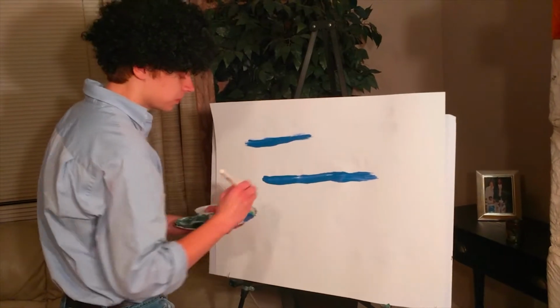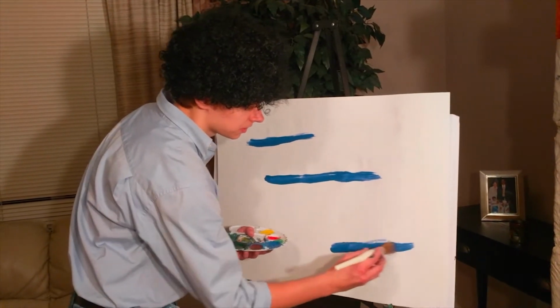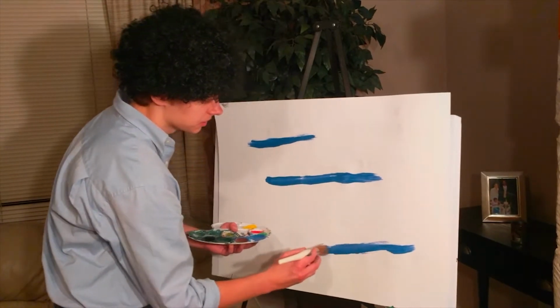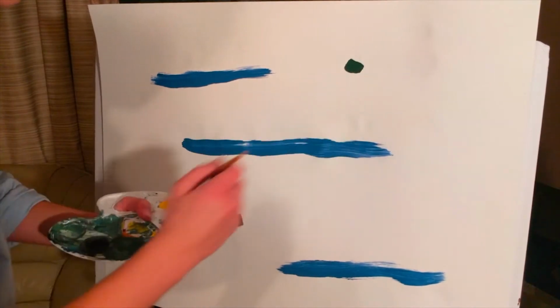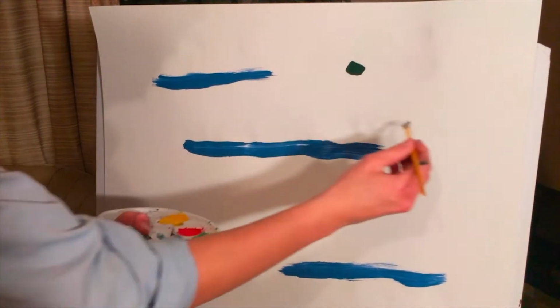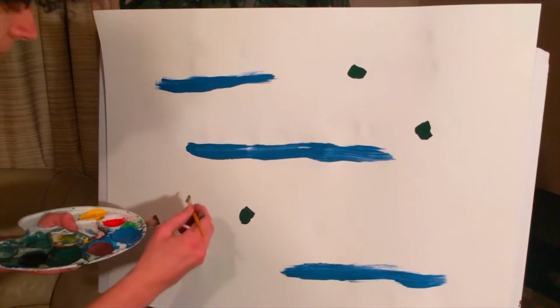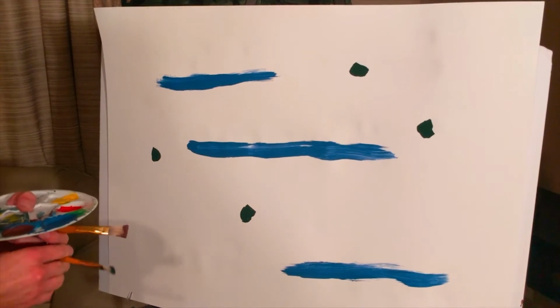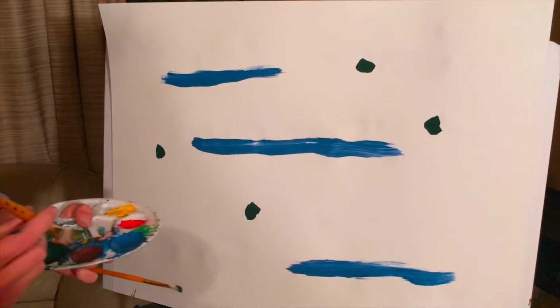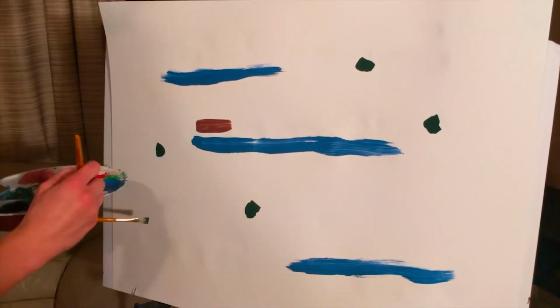In each one of those tubes you're going to put a whole lot of DNA strands, the ones that you want to figure out. But you've got to put a little bit else in there. So first we're going to add ourselves some deoxynucleotide triphosphates, all 4 of them, each one of the 4 in DNA. Just going to fill up the page with these little duders. And now we're also going to add ourselves some DNA primers so we can get our sequencing started.